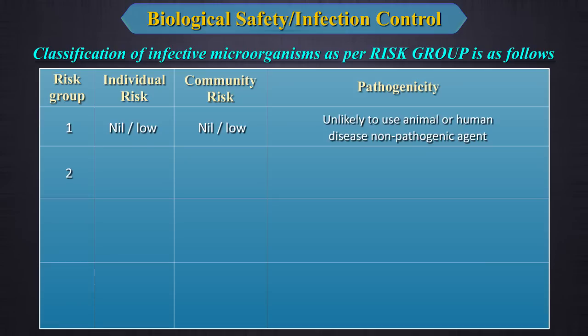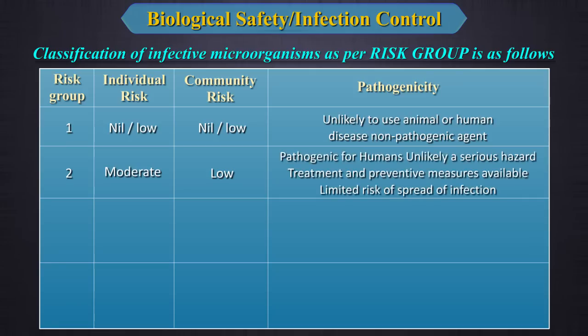Risk Group 2 is where the individual risk is moderate and the community risk is low. This organism is pathogenic for humans but unlikely to be a serious hazard. Treatment and preventive measures are available and there is a limited risk of spread of infection.